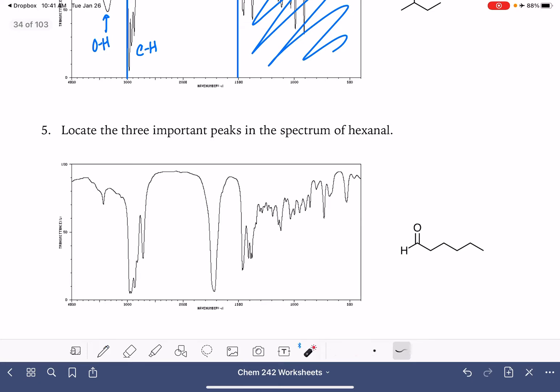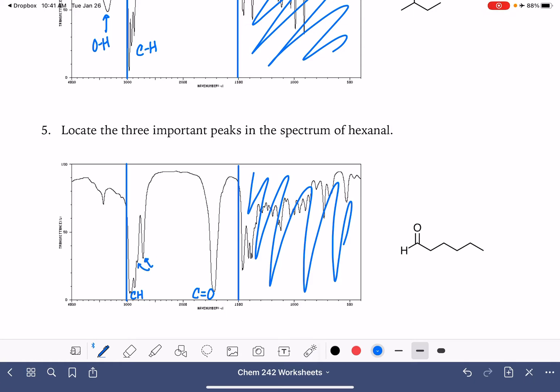Locate three important peaks in the spectrum of hexanal and aldehyde. So we'll draw our 1500 mark. We'll ignore everything over here. We'll draw our 3000 mark. This looks kind of interesting. Like this might trick me into thinking, maybe I have an amine because this kind of looks like a nitrogen hydrogen peak. This is definitely one that we should be paying attention to. A strong kind of broad peak in this area, that's our carbon oxygen double bond. We also have our carbon hydrogen bonds down here as usual. And then aldehydes have this characteristic. They have two peaks. One of them in this spectrum is kind of hidden. They have two peaks around 2700 and 2800 wavenumber that is indicating the carbon hydrogen bond of the aldehyde right there. And so there's this little one that's kind of hidden but it is there.